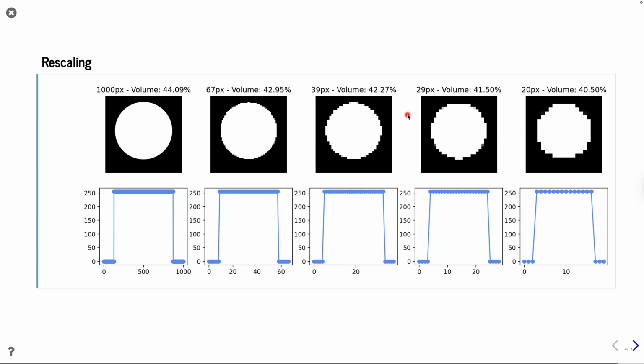You can even see, although it's difficult to see in this light, that the downscaling gives you some grayscale corners, so it's not even black and white anymore. And these are the profiles. They don't show these effects here because I hit it too well.